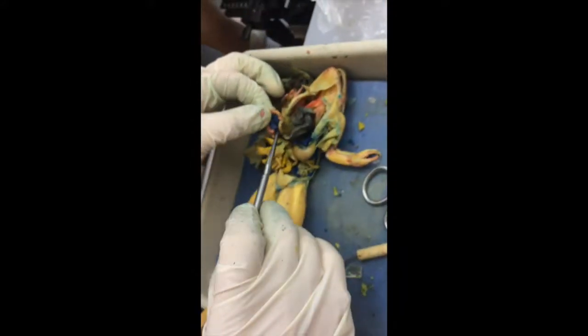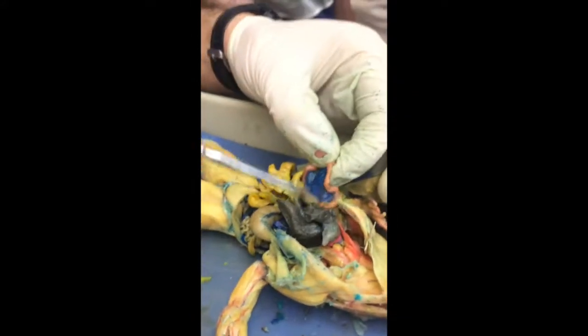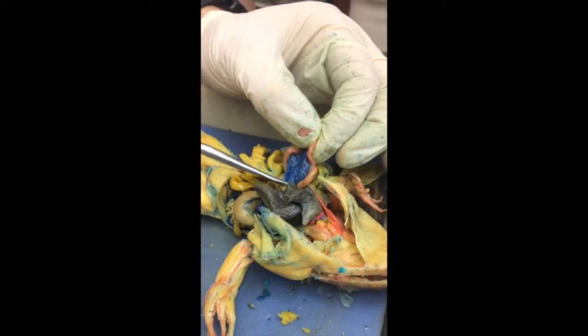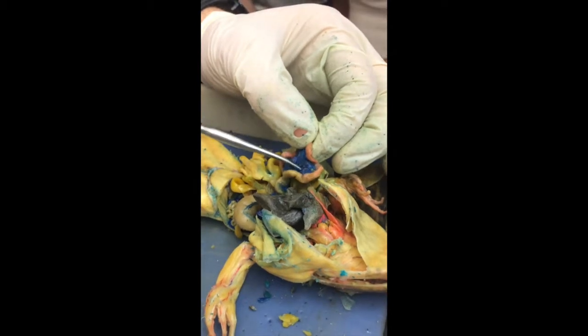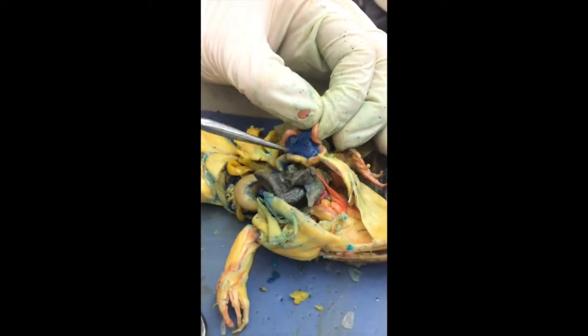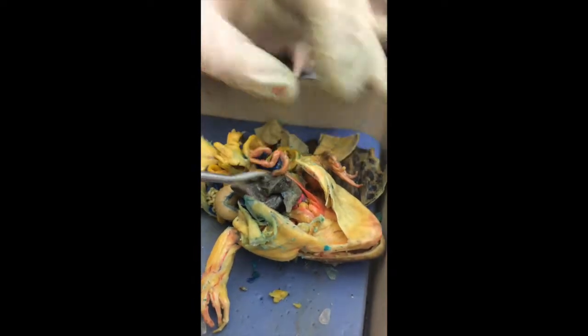Stomach. Following the stomach, you've got the intestines. You can see the mesenteries now very clearly. These are holding the intestines in place. There are a lot of blood vessels in there because intestines are absorbing nutrients, so they're going into the blood system. There's tons and tons of blood vessels there.